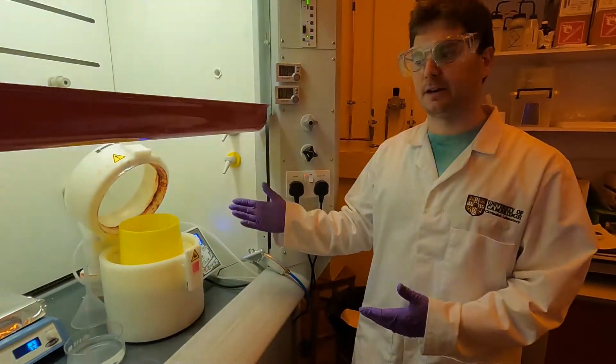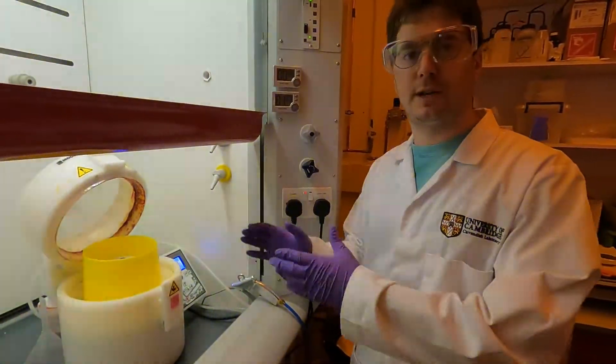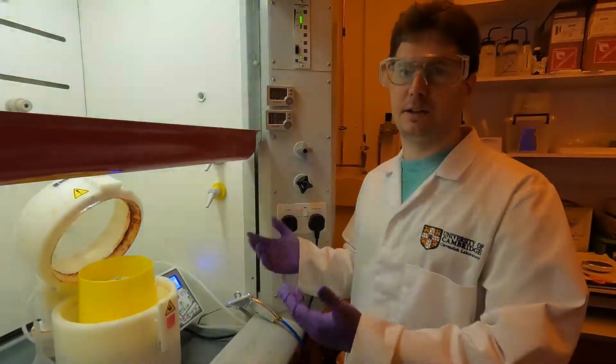Now the next step will be the spin coating. Before you take the sample off the hot plate and get ready to spin coat, you want to make sure that the settings for the spin coater are the ones that you want.